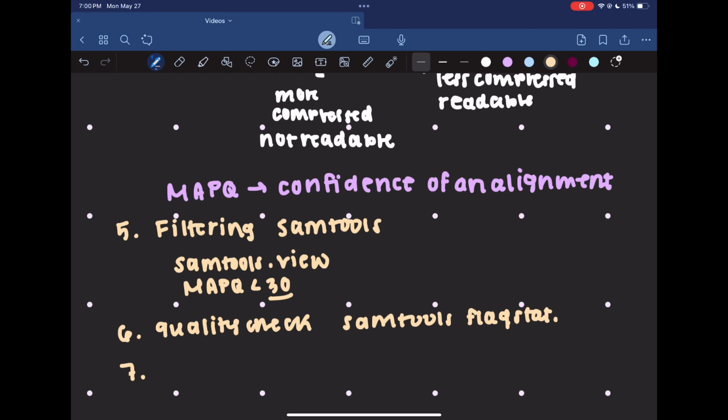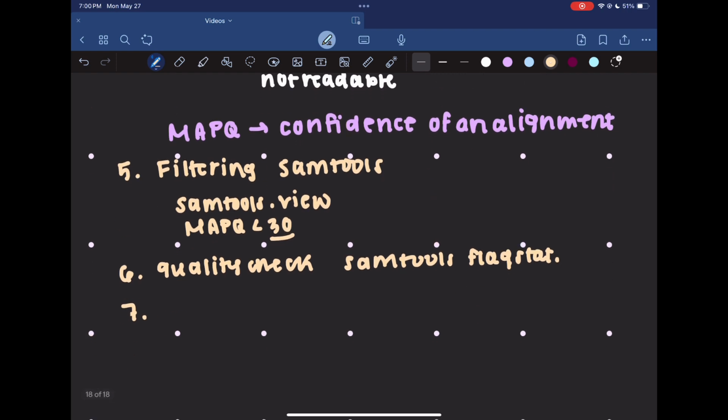If you had something like 30 or 40% mapping, you might want to go back and ask, do I realistically have enough alignments to do something with this data? So it has a really nice, easy output in the command line that you can look at. But I'll also link to some graphical user interfaces that people can use for this as well.